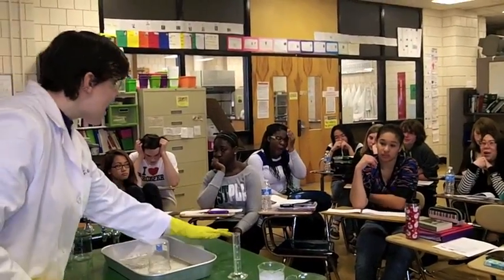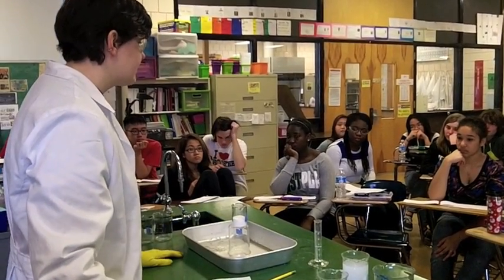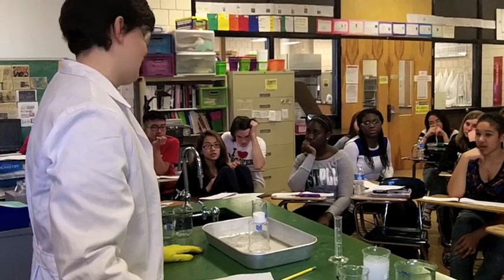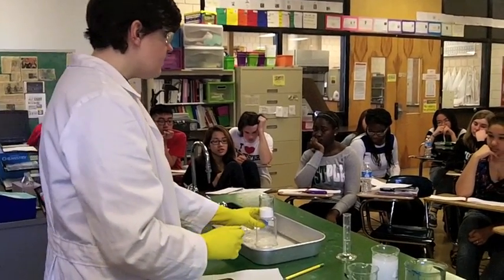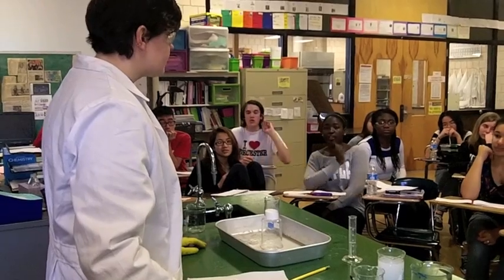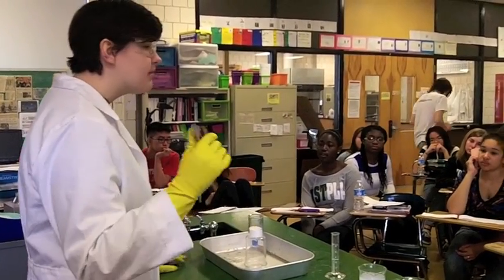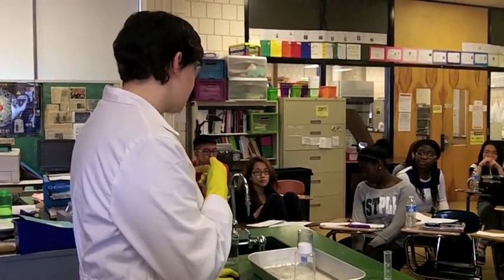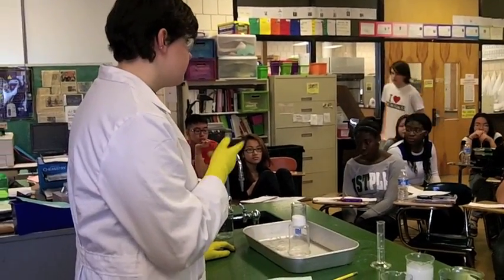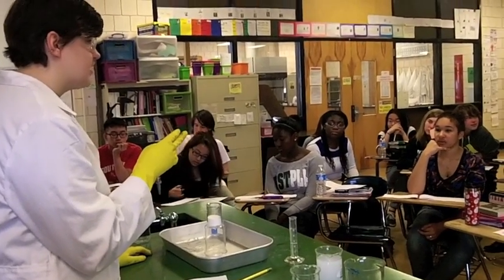Okay. So we have carbon, hydrogen, and oxygen. So what do you think this is going to look like? Is it going to look like diamonds when it's done? Maybe a little like ashes. Okay. Do we have any other predictions about this reaction? Think it might bubble? We've talked about some different indications of a chemical reaction. So, you think it might get hot? Maybe it'll get hot. You think it might look like ashes when it's done? What else? Anything else?